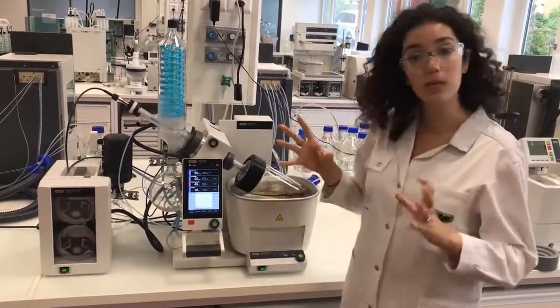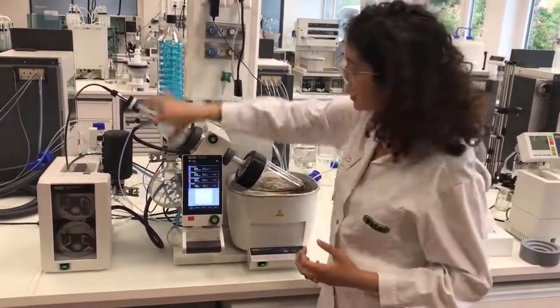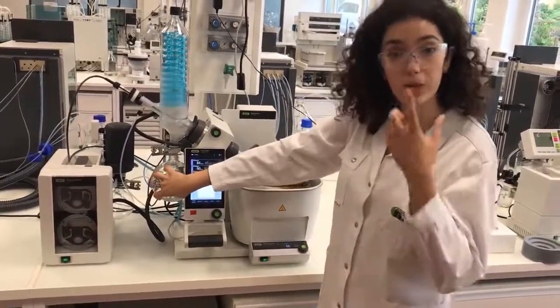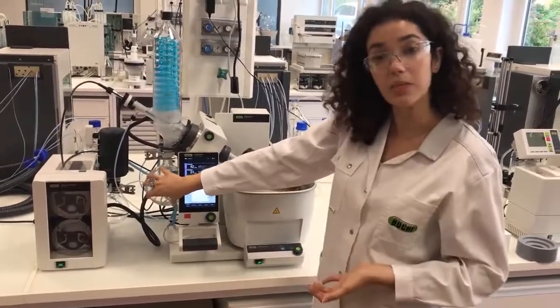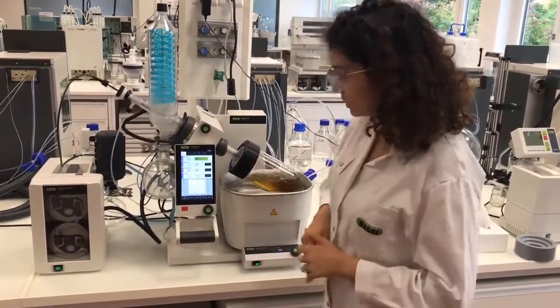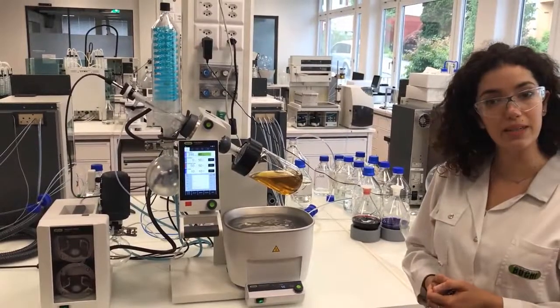In the end, the water will be evaporated. I will get water here. So I will get clear water with the taste of mint tea. So that's the kind of application that you can have. Then to stop everything, I just press stop and it goes automatically.